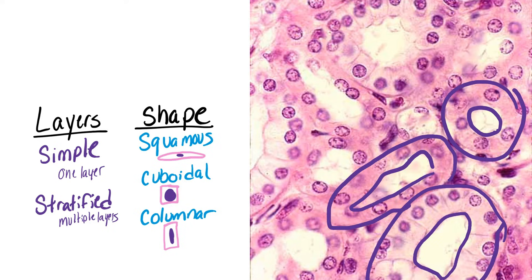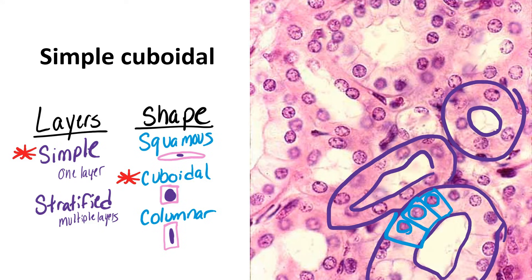Here, we don't have multiple layers of cells. We have multiple single layers of cells that are all lining their own open space, so this will be simple. And when we look at the shape of the cells, you might debate: is that a cube or is that a column? Pay attention to the shape of the nuclei — if it is a circular nuclei, it is cuboidal. So that makes this simple cuboidal epithelium.